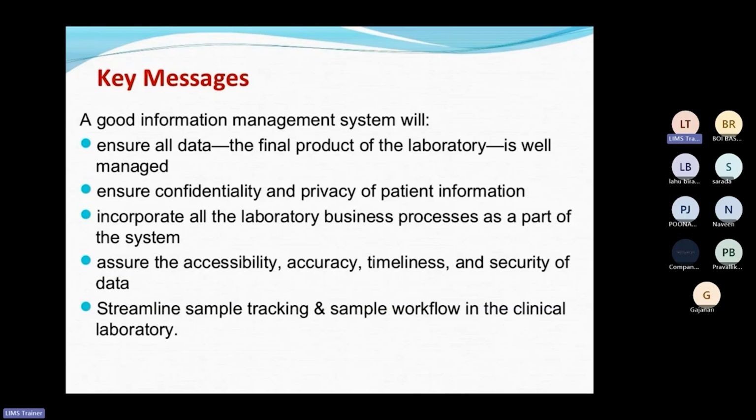Also the accuracy. Suppose different instruments are integrated with the software, starting from HPLC to weighing balance. Accuracy means that whatever, suppose 1 mg weight is shown on the weighing balance, the same should be incorporated into the software, right? There should be no change, and 1 mg should not be shown in some different decimal. That is how the integration will be, and that accuracy is required inside the software. Then it will be good information management.